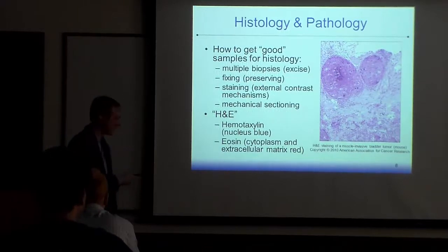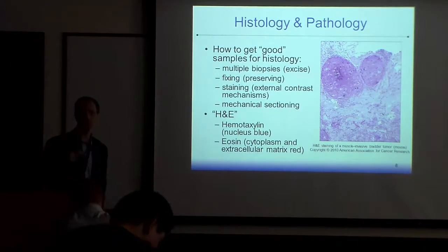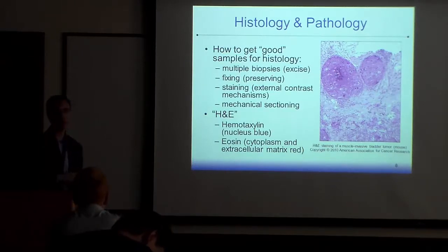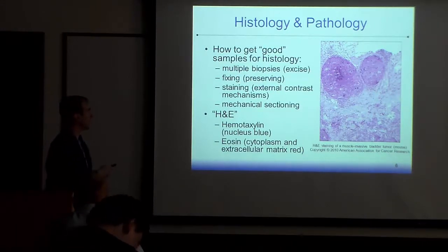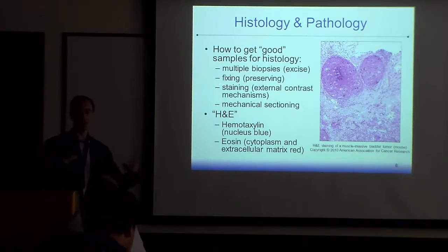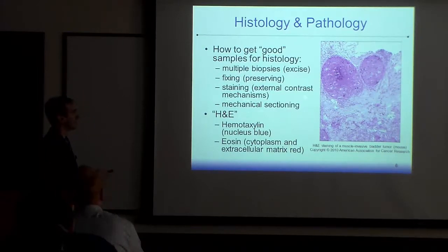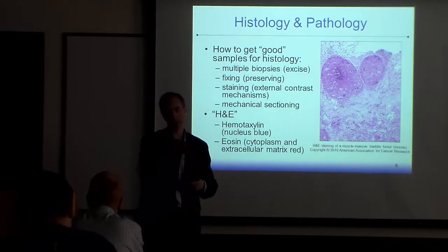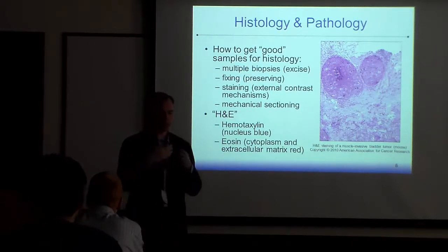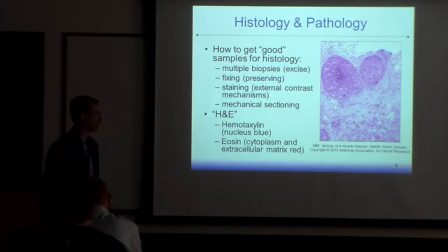Okay, but to get these good samples, the problems that us as engineers are trying to solve are, well, you need to sometimes take multiple biopsies. You got to go in there and actually cut out the tissue. We have to fix or preserve it, so we have to put it through a chemical process, driving out all the water, replacing, cross-linking the proteins, basically making it preserved so it won't rot on you. And then we have to stain it. We introduce external contrast mechanisms so that we can see where the interesting features are in the cells or in the tissue. And then we have to mechanically section it. So we have this mass, and we basically put it into a giant deli slicer, well, a small deli slicer that just slices it up into a couple micron slices, and we put them on slides. And then we have a team of several pathologists who sit around with these slides and look at them and do your diagnosis, and can aid the other doctors who are planning the treatments.